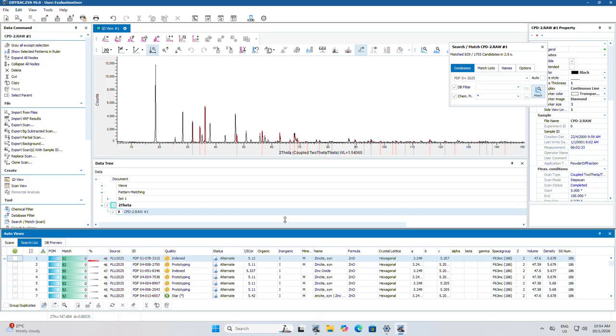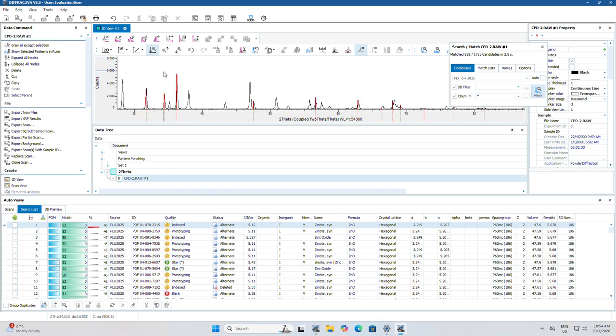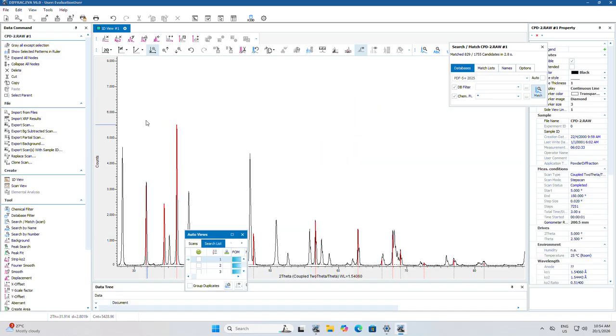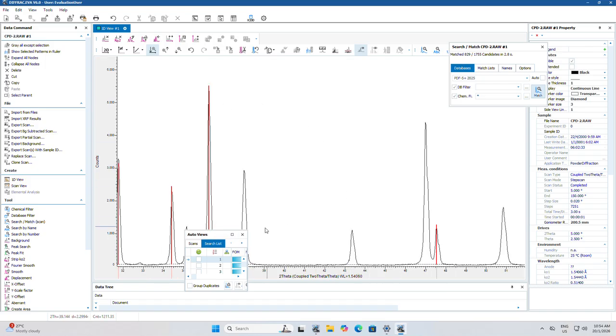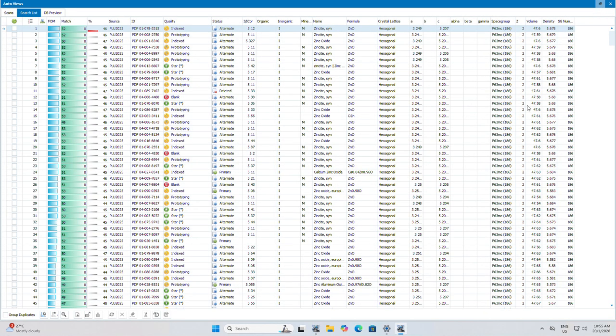Okay, now the software will suggest you the list of database is around 829 database. Okay, so you can choose one by one to make the database go inside match with your pattern. You can zoom your result. Okay, you can zoom the result like this, and then you can unzoom, just click 45 degree like this. Okay, just make it small.